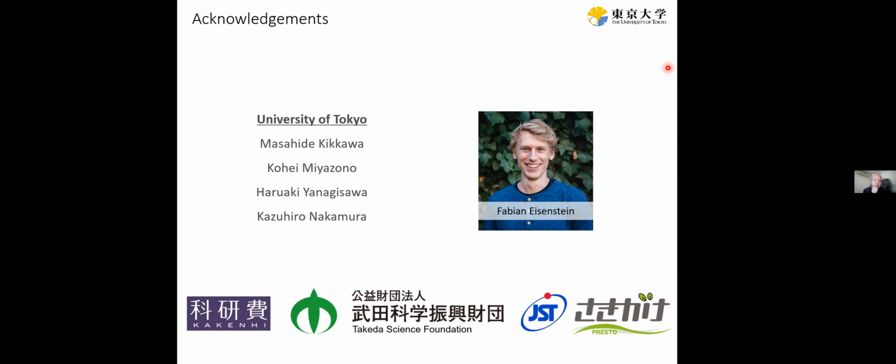And yeah, the differences may be insignificant in terms of modeling. Say if you want a 0.2 angstrom resolution difference in your map, that probably won't affect much the quality of the map or the ease of modeling, but they accumulate. So if you combine several factors, you may get a 0.5 angstrom difference. Then that's significant in practice. And of course, the gold grids were the biggest factor in a sense that they gave us this 0.5 angstrom improvement overall and more consistent sample preparation.